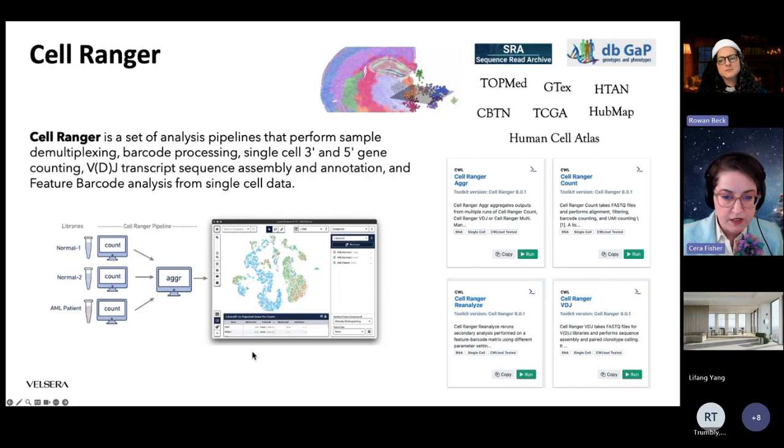I was really pleased with how easy this was to use. Granted, it's going to be easier with 10x Genomics data rather than other library preparations, but if you've got 10x data, it can be analyzed on the CGC.